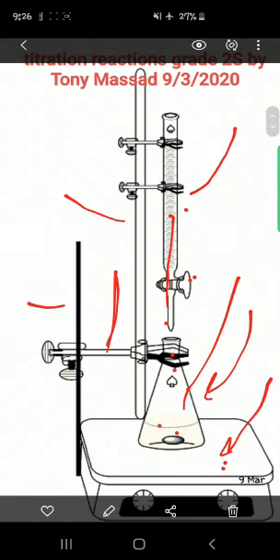Now we need to replace the n with the C and the V. Let's just say that the legends for the potassium permanganate solution in the burette are C1 and V1E. V1E represents the volume of the potassium permanganate added from the burette to reach the equivalence point. And of course, C1 is the molar concentration of the potassium permanganate solution.